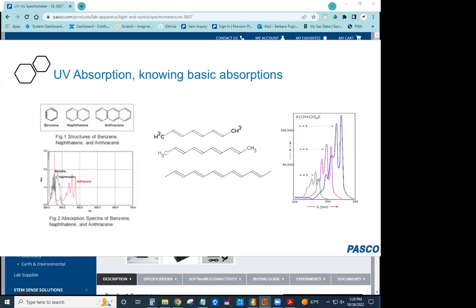that you're interested in. Double bonds in a straight chained hydrocarbon are also absorbent down here in the ultraviolet, and that's what you'll want to use this tool to determine. But it does need to have several that are every other bond. They're able to be conjugated or dispersed. That double bond can move, the electron density can move across that molecule when they're that close.